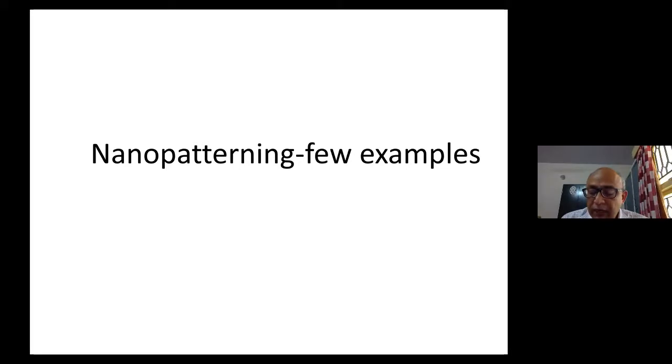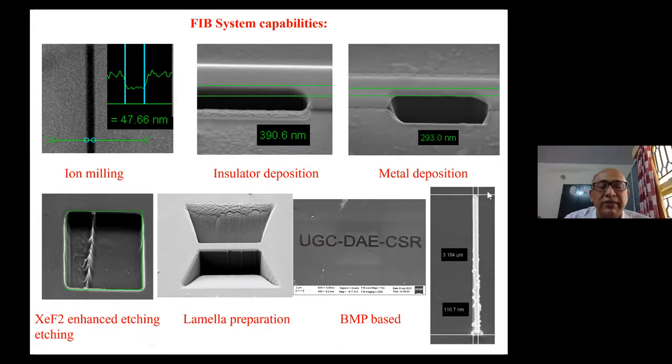So here I would like to now switch over to the FIB SEM facility, where excellent nano patterning has been done. So I thank Dr. Pandian for sharing some of his slides. I'm not an expert in this, but I'll just share with you some of the things which can be done using this technique.